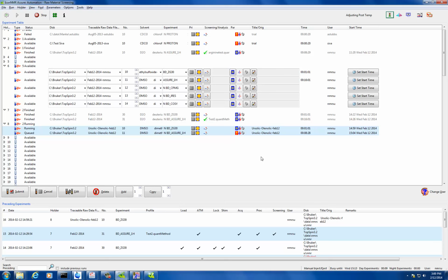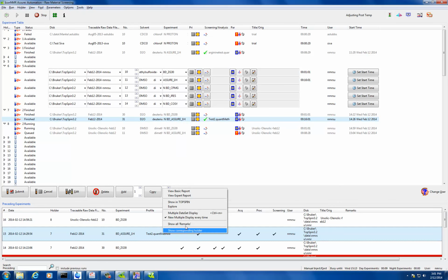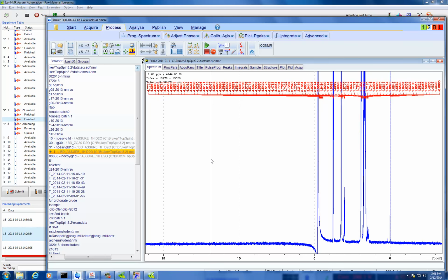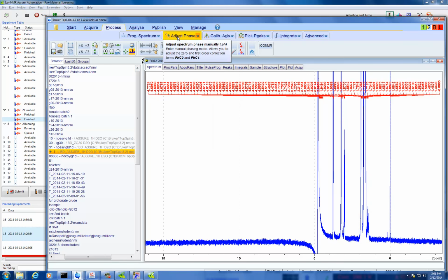I mean, I could always just leave that in there. Some of it comes in a tube. They range, some are like $100, some are more. Should we pick one that doesn't overlap with a lot of our spectra? We have a lot of stuff that overlaps. Or is concentration important?